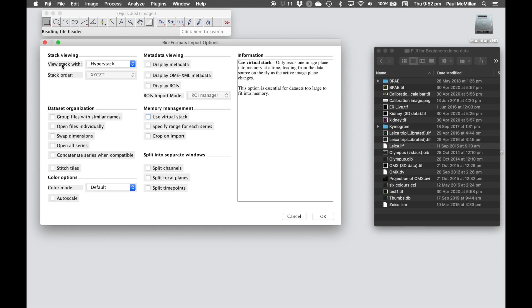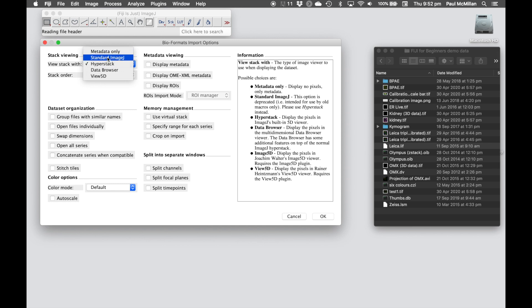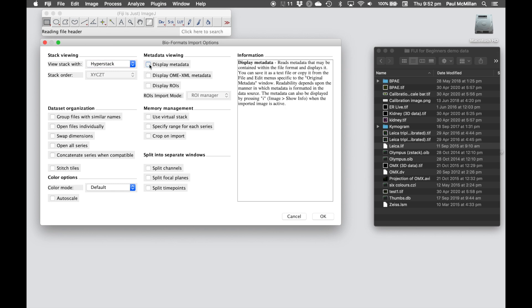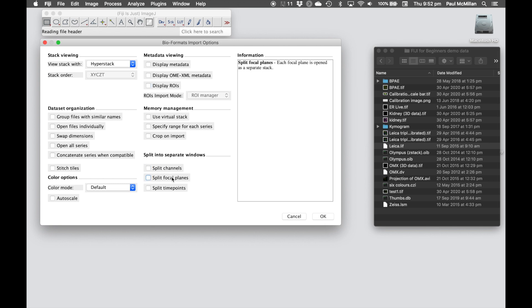For example, we have Hyperstack. You can open up just the metadata. If you're old school, you can go to standard ImageJ. Mostly I use Hyperstack. Here you can display metadata, and that will open up a separate window as well as your image window that has the metadata. Down the bottom here we can hit split channels, split focal planes, or split time points. Just be wary doing this that if you have a hundred time points and you hit split time points, you'll end up with a hundred images open within Fiji, and you'll soon learn what the close all function is within Fiji.